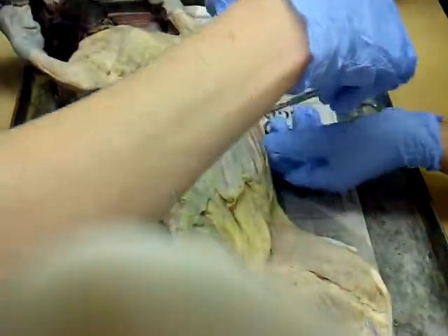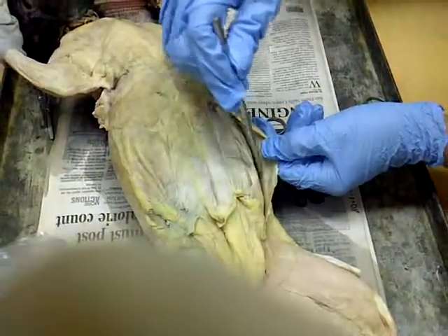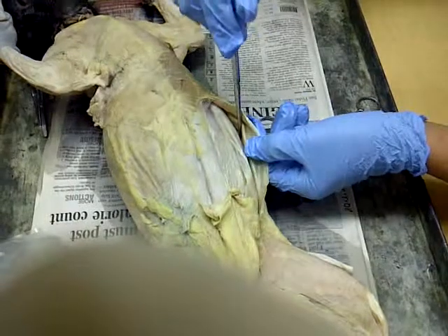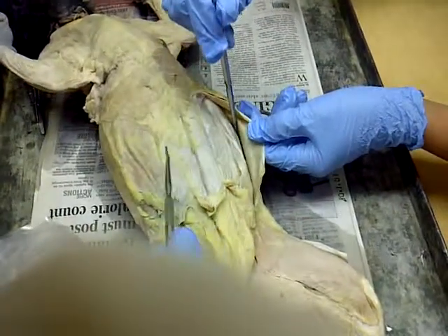And then if you open it up in there, this section right here that's going outwards, going into your back pockets, that's the internal oblique. There are only two obliques: external oblique, internal oblique.